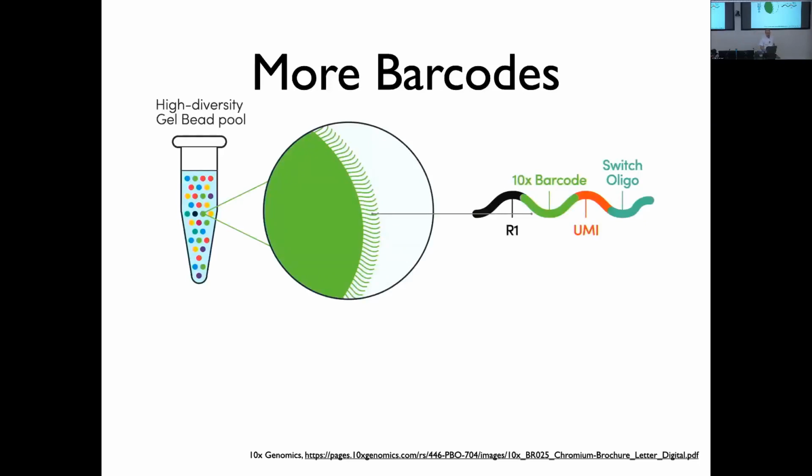And so that's why you have a random set of UMIs on a given bead. But of course, you need all the same cell barcode on a bead because you want all the RNAs from a given cell to be able to count back to that cell. Barcodes are unique for a cell. Yeah. So if you see barcode 3024, you might see 10,000 different RNAs from barcode 3024.